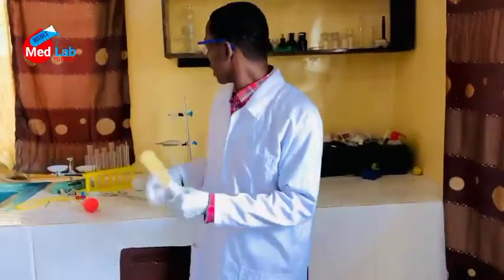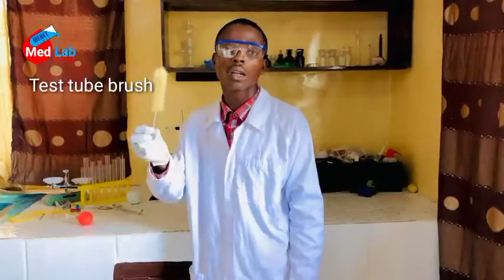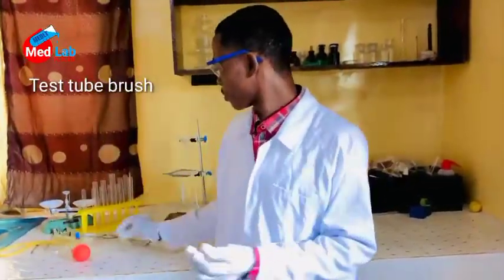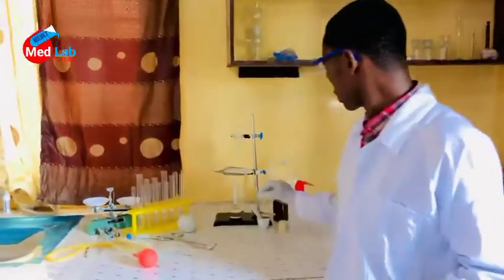This is common, and I know everyone here knows it. This is the test tube brush. The test tube brush is used to clean a container that we cannot put our hand in. You see this? Now we can use it to easily clean this tube.